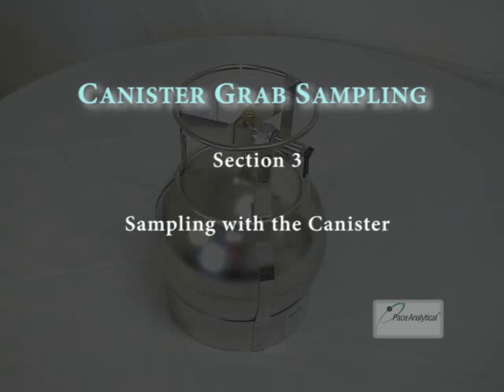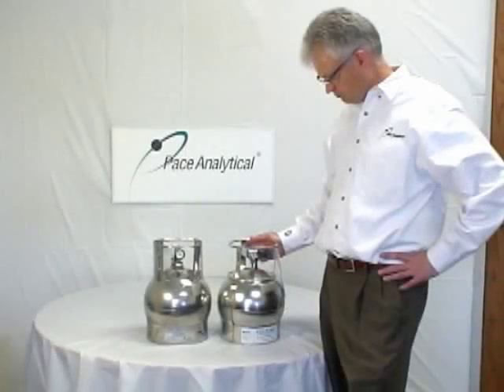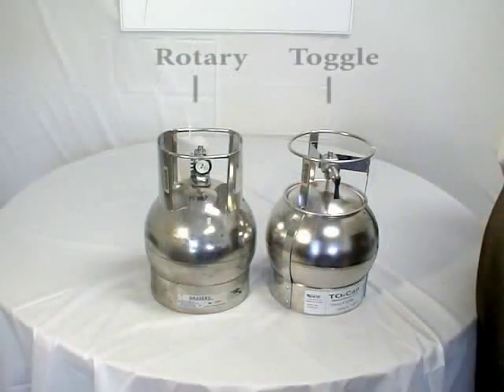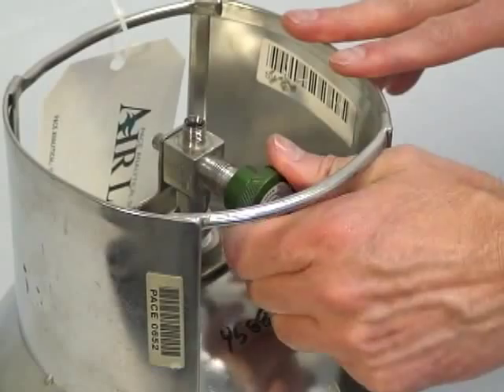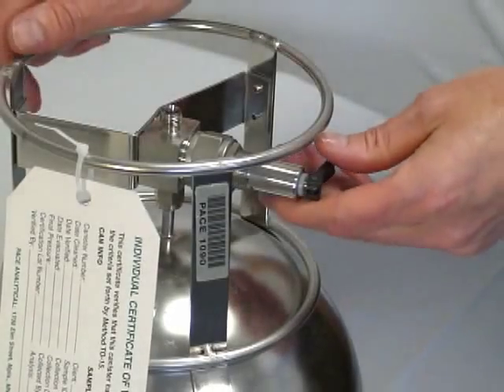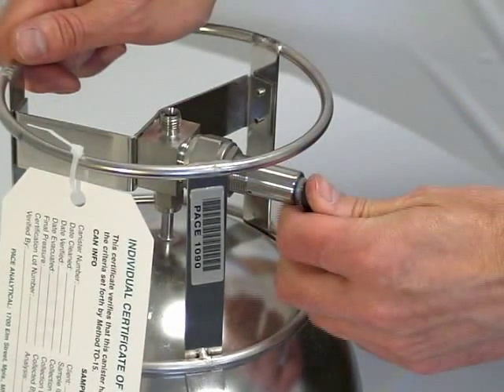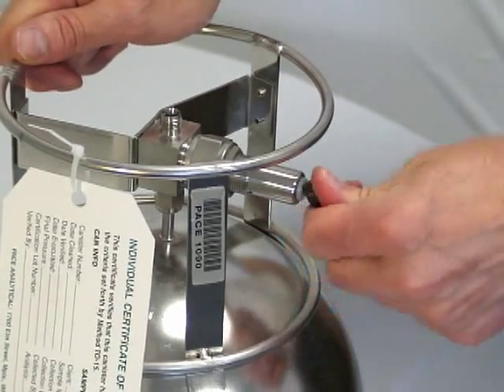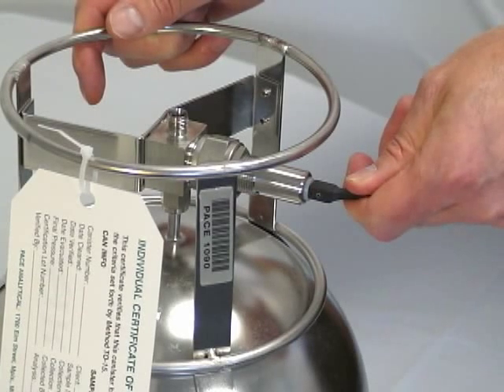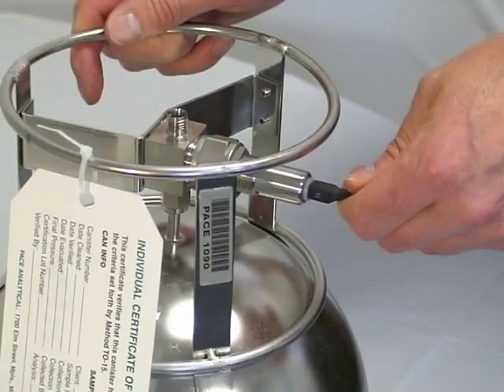Section 3: Sampling with the canister. Now it is time to sample. To begin sampling, simply open the canister valve. There are two types of canister valves: the rotary valve and the toggle valve. The rotary valve is opened by turning the valve one full turn counter-clockwise. The toggle valve is opened by flipping the toggle upward. During the initial sampling process, you will hear a rush of air as in this example. The grab sample will fill in approximately 30 to 45 seconds. Once the rush of air has surpassed, close the valve in the opposite manner you opened it.